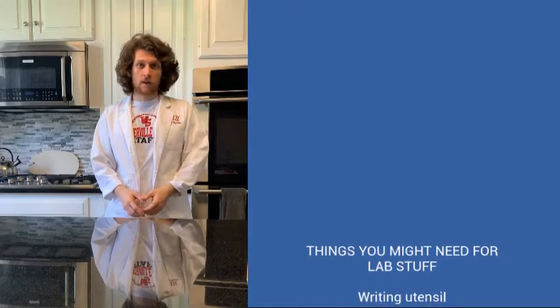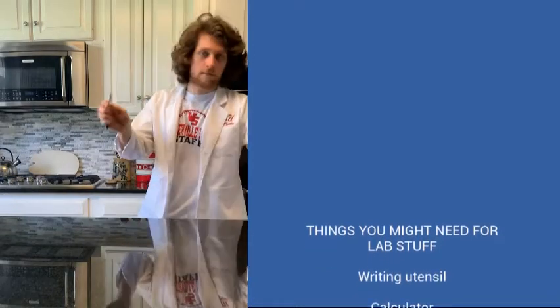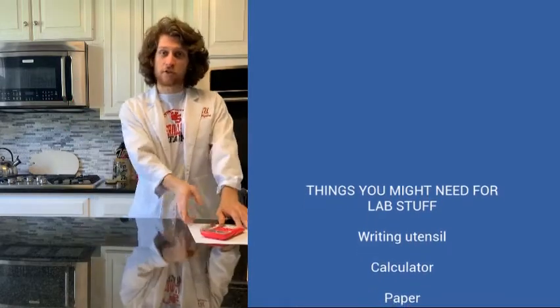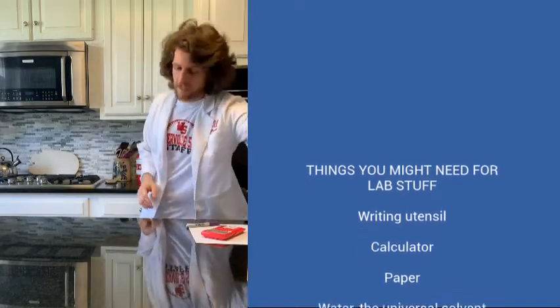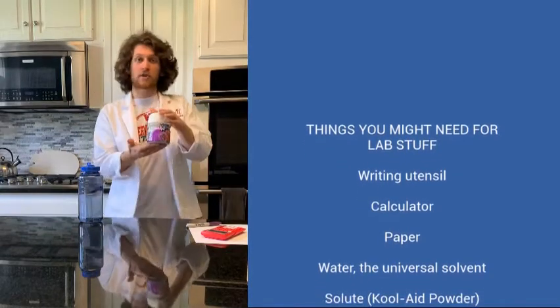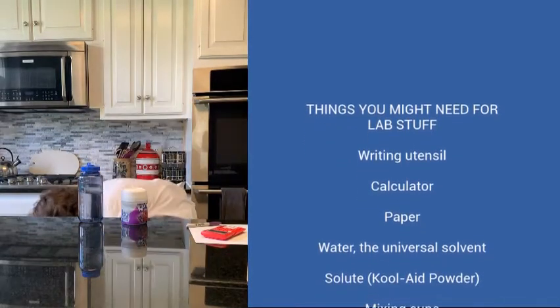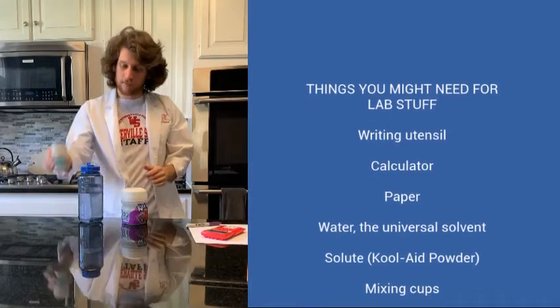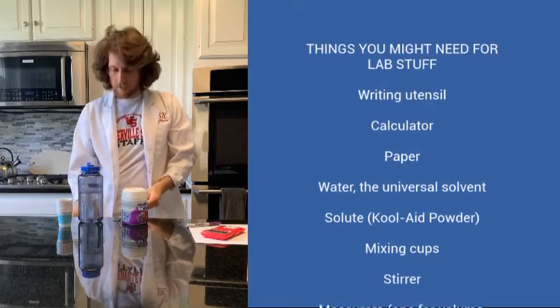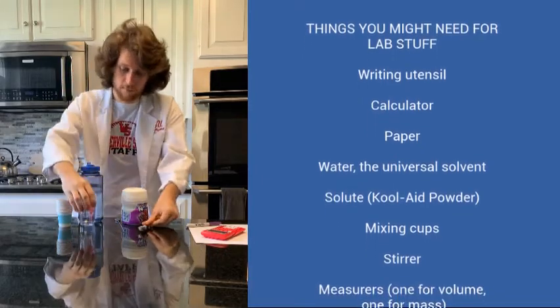If you're following along, some things you might need: writing utensil, calculator, paper, and then to do the lab, all we need is our solvent, a solute, something to mix them in, something to stir it with, and something to measure each with.